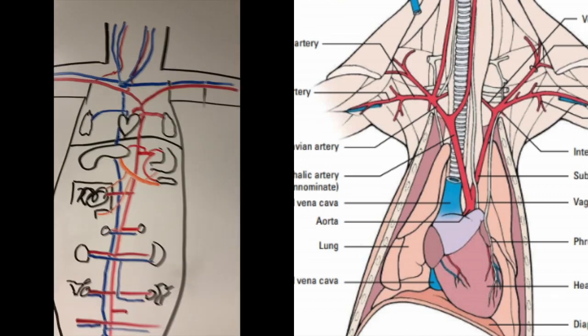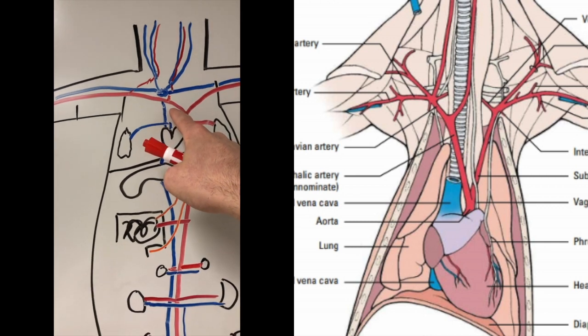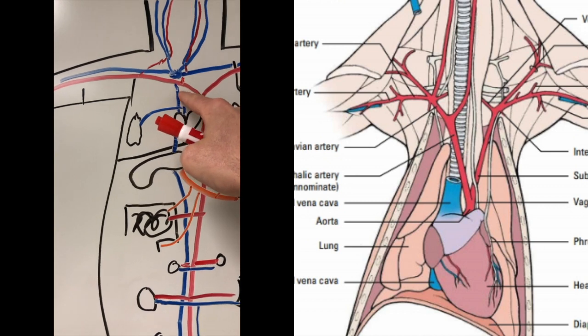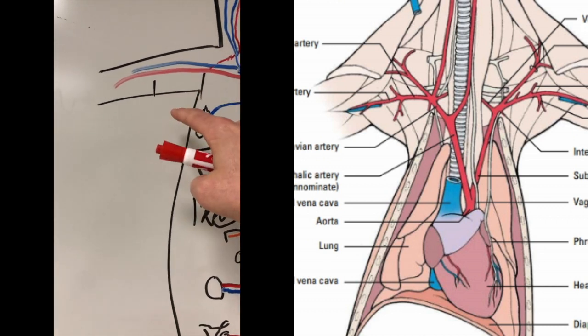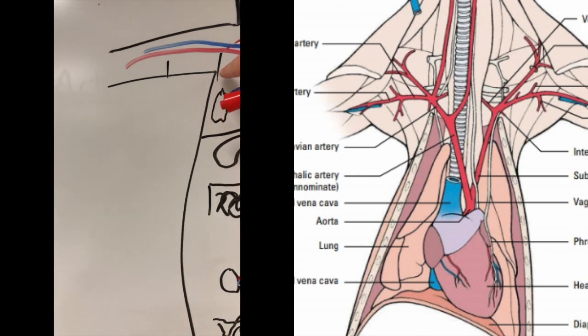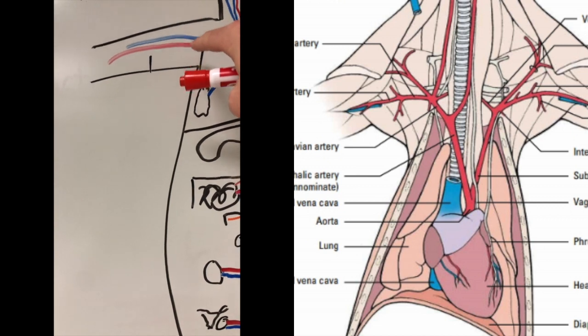And so we have the brachiocephalic trunk. I'm sorry, the right brachiocephalic artery, the right subclavian. So right here, this is the right axillary artery. Your axillary region means your armpit. So basically from where it leaves the body wall into the beginning of the arm, it's the armpit. So that's the right axillary artery.